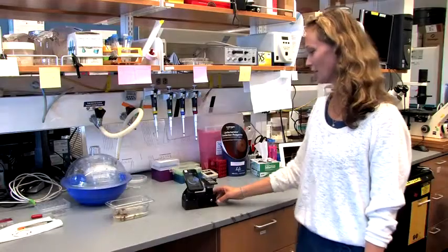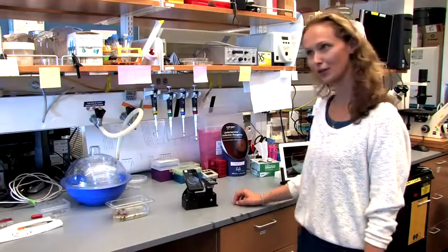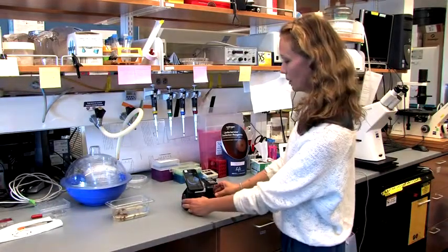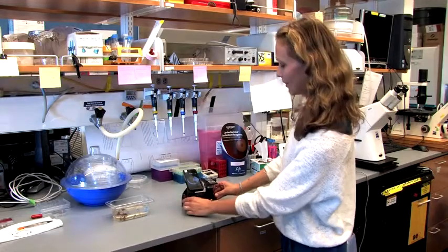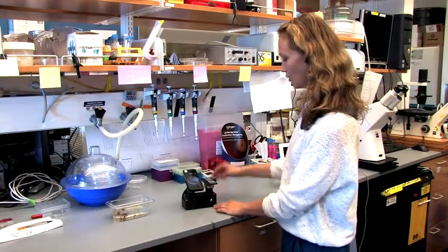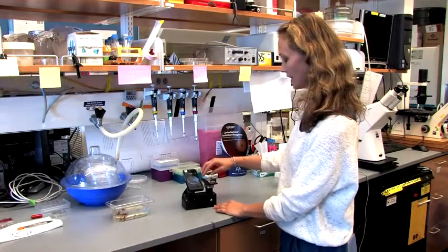This is our current version of Cellscope that we use for education. And what you see here is a 3D printed part. So all the black plastic stuff you see here is printed on a 3D printer in our lab. And you have a sample that is here on this glass slide.